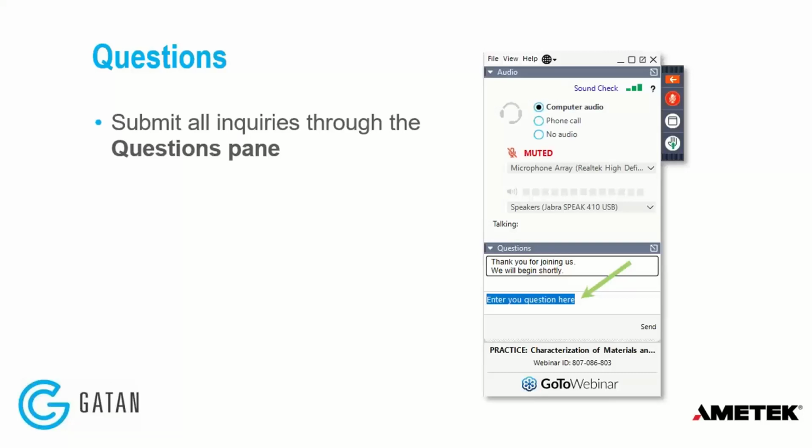Right, and here's another question. What do we intend to use the data for, and what do we plan to do next on the sample? I can take that one. The data will be used to guide subsequent analyses, such as looking at nanoscale features of these growth domains using transmission electron microscopy.